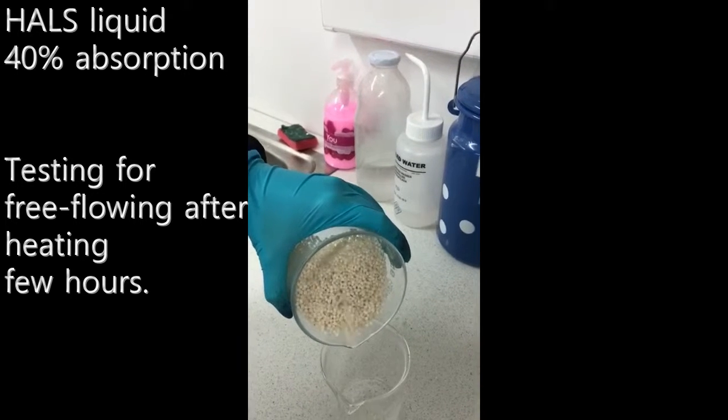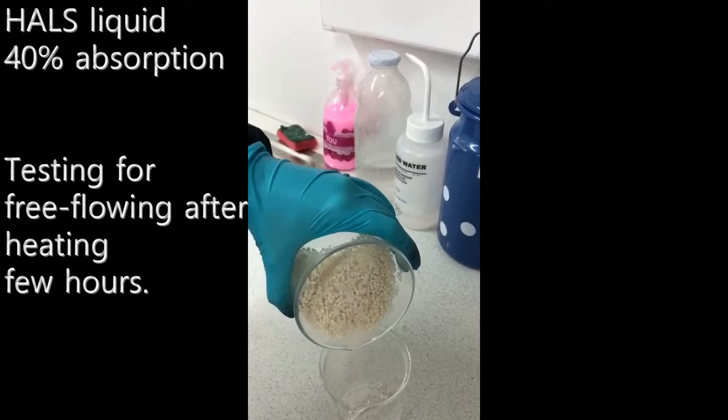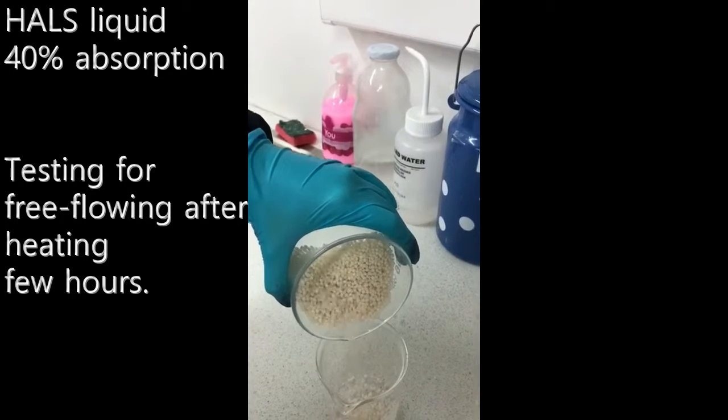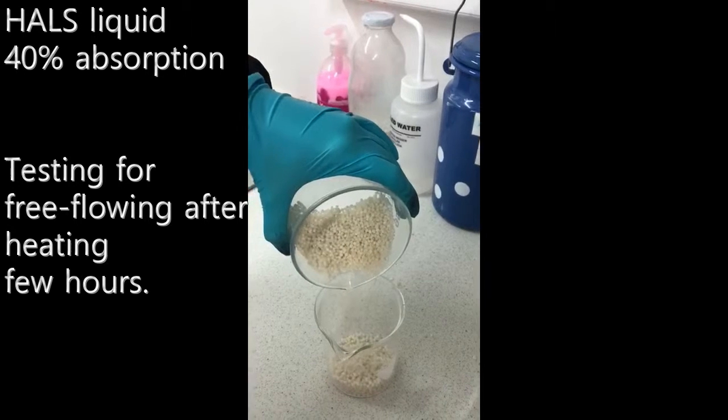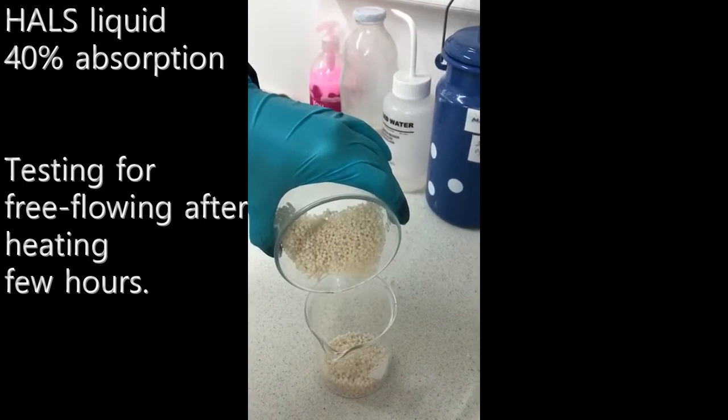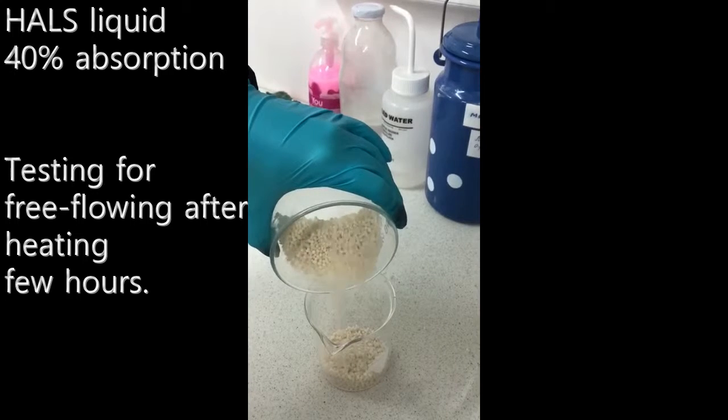We check the flowing behavior of porous granules with HALS. As you can see, they are completely free flowing, so the flowing behavior remains practically the same.